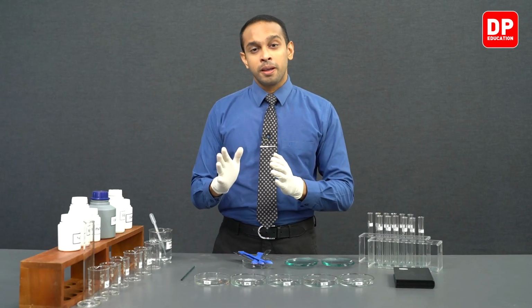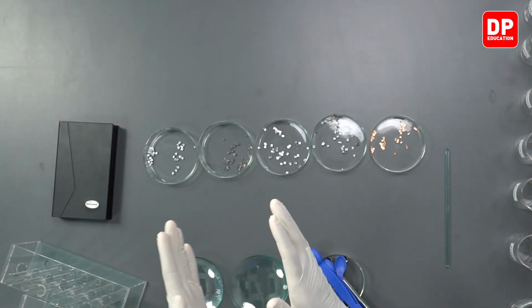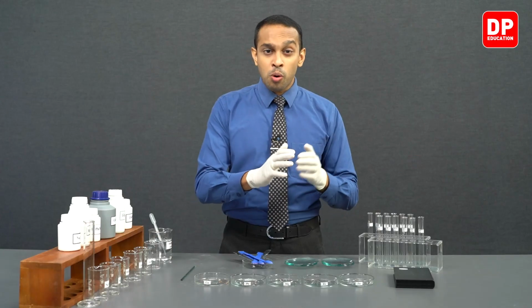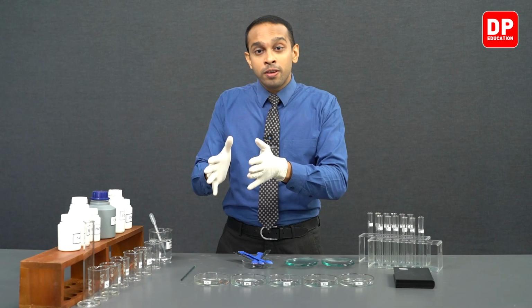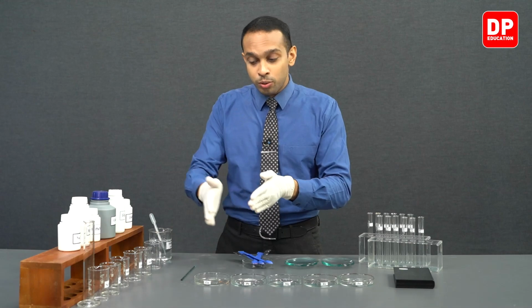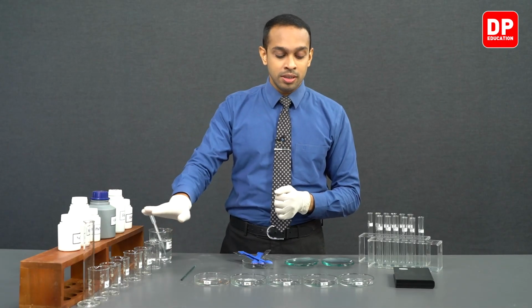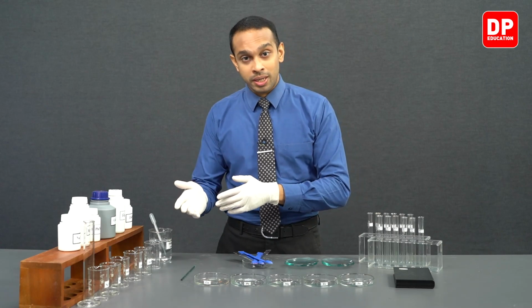So students, in this experiment we are going to observe how the different metals that we have over here react with the different solutions that we have over here. More reactive metals are capable of displacing metal ions of less reactive metals. So when we add each of these metals into these solutions containing different metal ions, if the metal ions present are less reactive than the metals introduced into these solutions, we can observe a reaction happening.